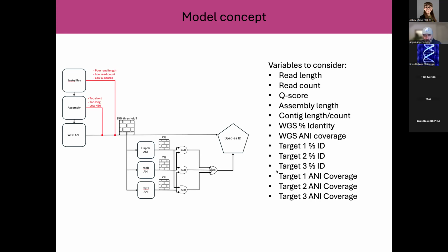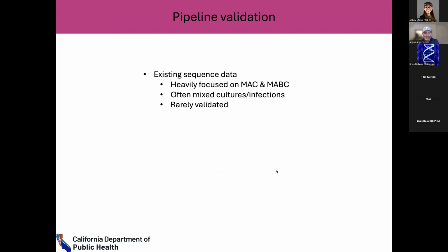So I need, some of these I can make pretty good guesses at. Some of these assumptions are pretty basic, but some of them can widely vary. And with every additional variable that I need to create a threshold for, validating this pipeline can get a little bit more complex, almost exponentially.